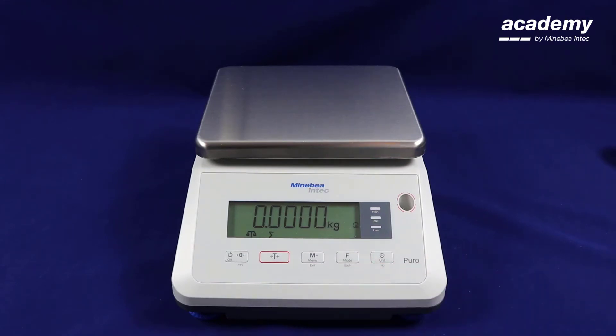To bring up the statistics from your previous weighings, press the function key once when the load plate is empty. Now press the M plus key. On screen it will display the number of weighings, the total weight, the minimum weight, and the maximum weight.